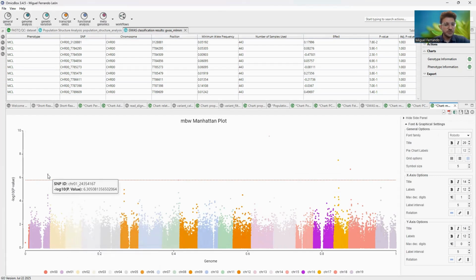The first one is in chromosome 1, then we have another one in chromosome 13, another one in 17, and 18. So we have located those SNPs within specific chromosomes, as discussed earlier. I'm happy with this final plot, which is very cool and has a lot of colors. So we can go back to the presentation and conclude the analysis.